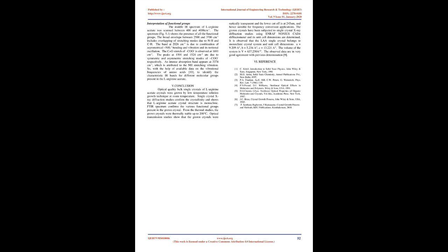Conclusion. Optical quality bulk single crystals of L-Arginine acetate were grown by the low-temperature solution growth technique at room temperature. Single crystal X-ray diffraction studies confirm the crystallinity and show that the L-Arginine acetate crystal structure is monoclinic. The FTIR spectrum confirms the various functional groups present in the grown crystal. From the thermal studies, the grown crystals were thermally stable up to 200°C. Optical transmission studies show that the grown crystals were optically transparent and the lower cutoff is at 245 nm, and hence suitable for frequency conversion applications.